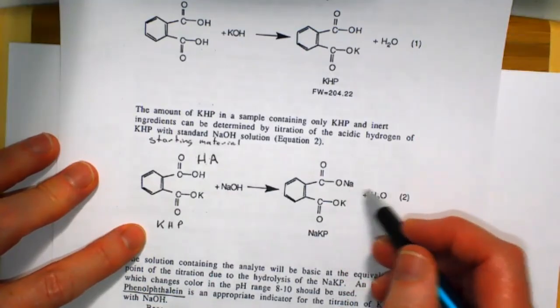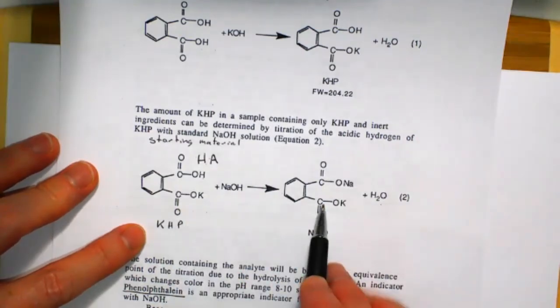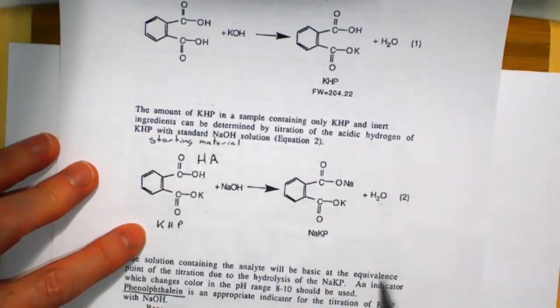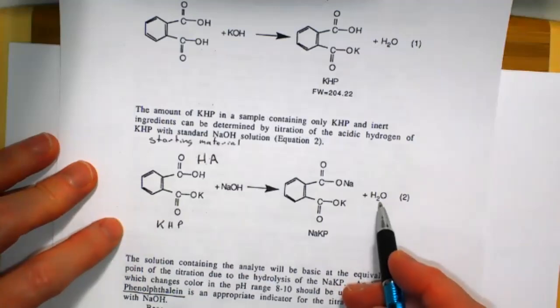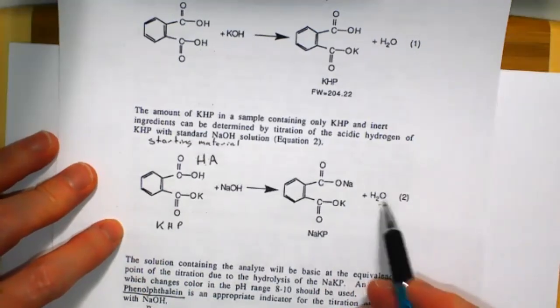So if you do the titration exactly to the end point, also known as the equivalence point, actually, since it's theoretical, then we should have just salt water. So salt water.